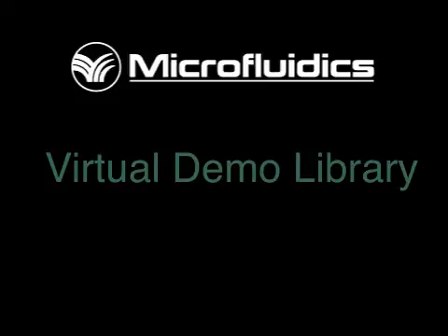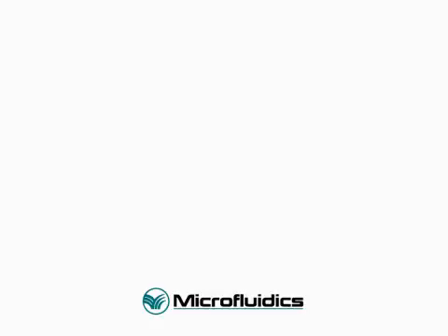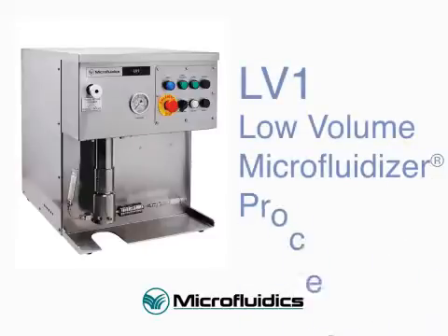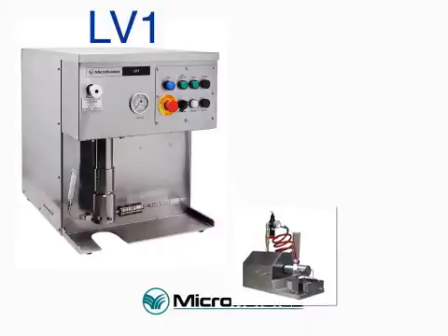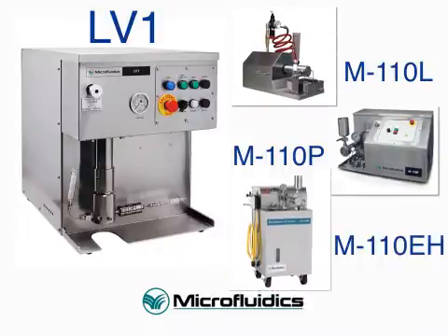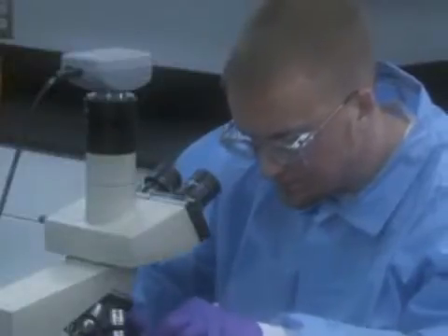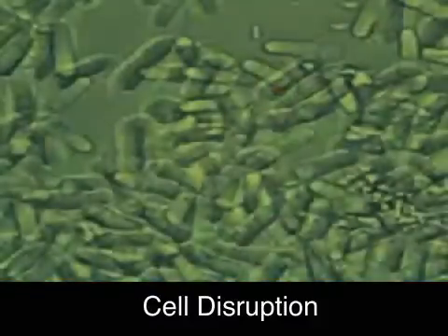Welcome to the Microfluidics Virtual Demo Library. Today we will demonstrate how easy and effective it is to process an oil and water emulsion using the LV-1 Low Volume Microfluidizer Processor. The LV-1 is a unique product in the Microfluidics line of laboratory equipment, bringing scalable and uniform high shear nanomaterials processing to samples as small as 1 milliliter. It was primarily designed for biotechnology and pharmaceutical companies as well as university research teams working with high value samples or who have limited access to materials and resources.